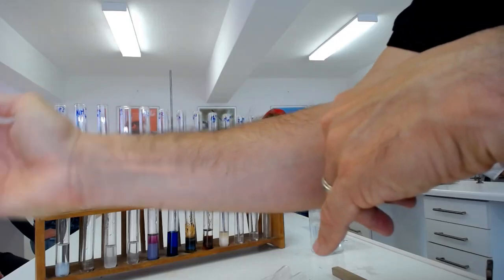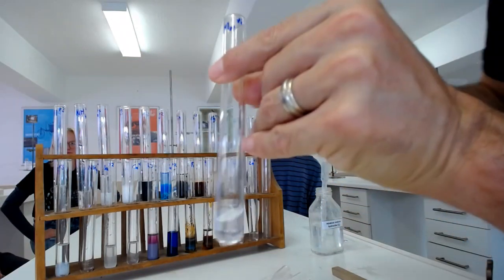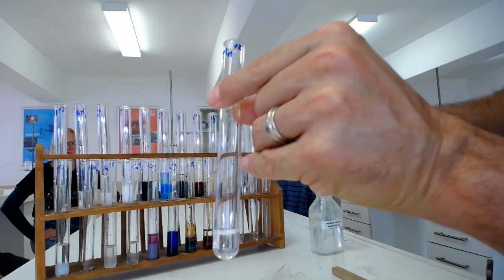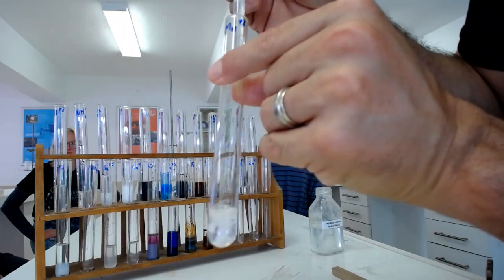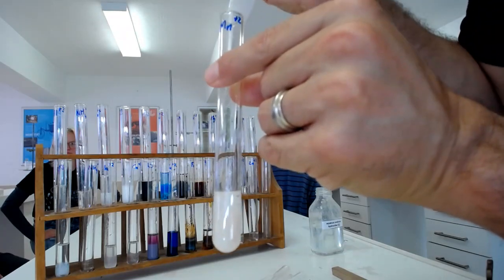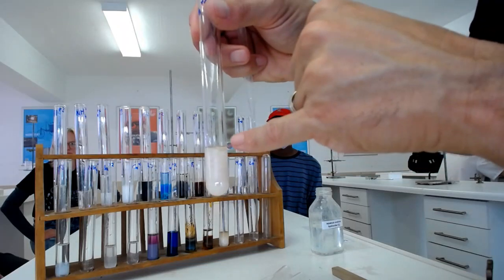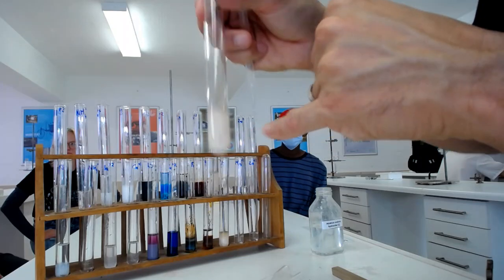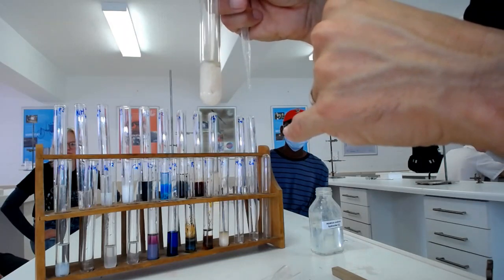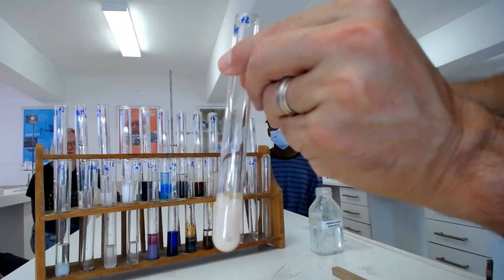Right, so same thing. Let's do manganese. What do we expect? I thought we're in zinc now. Sorry, I did manganese now. So manganese gives me also a white, but there's also a browning. Is there supposed to be a browning? Just mention it. What happens if I add it in excess? My sodium hydroxide. Soluble.